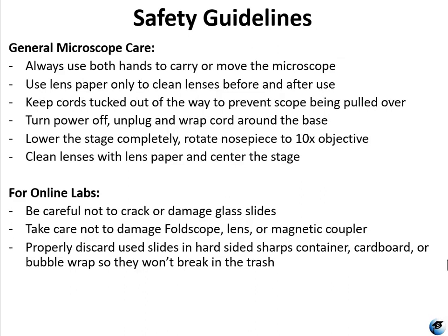And when you're disposing of your slides, you want to make sure that you're either putting them in a homemade sharps container that has hard plastic sides, or you're wrapping them in cardboard or some kind of bubble wrap or something that's insulated so that it won't break in your trash can.